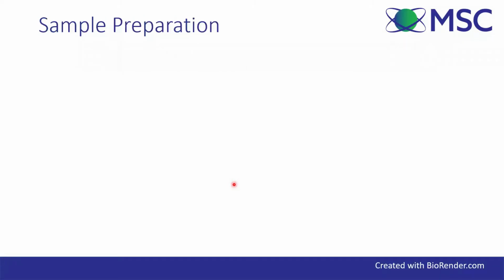So sample preparation. Now, there are actually many different samples you can use. I've given you a selection, I think, of between 6 and 8 samples.